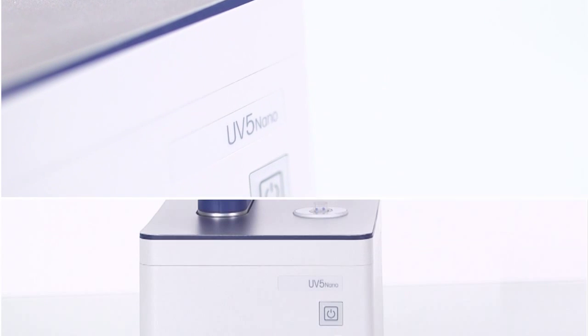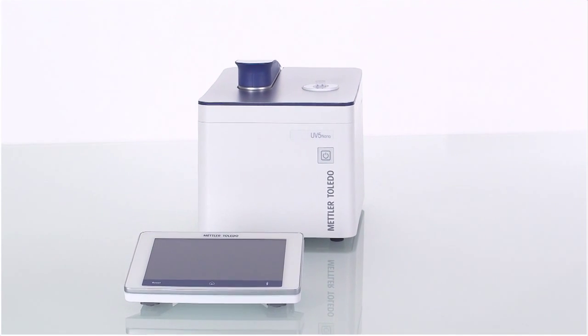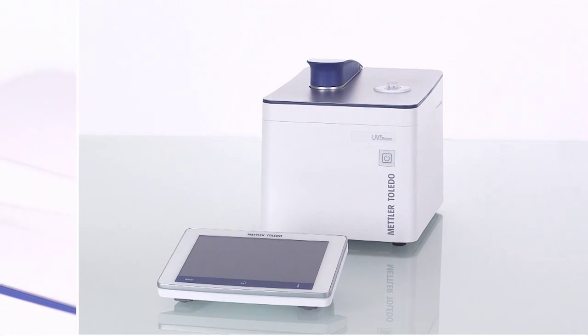Let's have a look at the microvolume measurement platform of the UV-5 Nano. It consists of an optical cell and mirror situated within a movable arm.